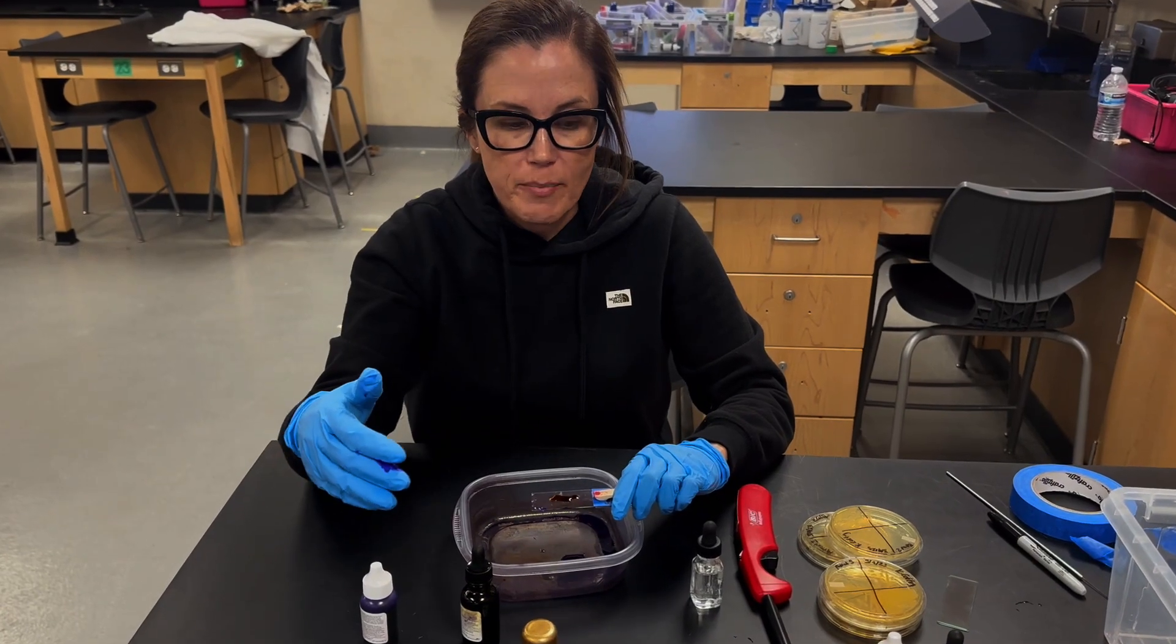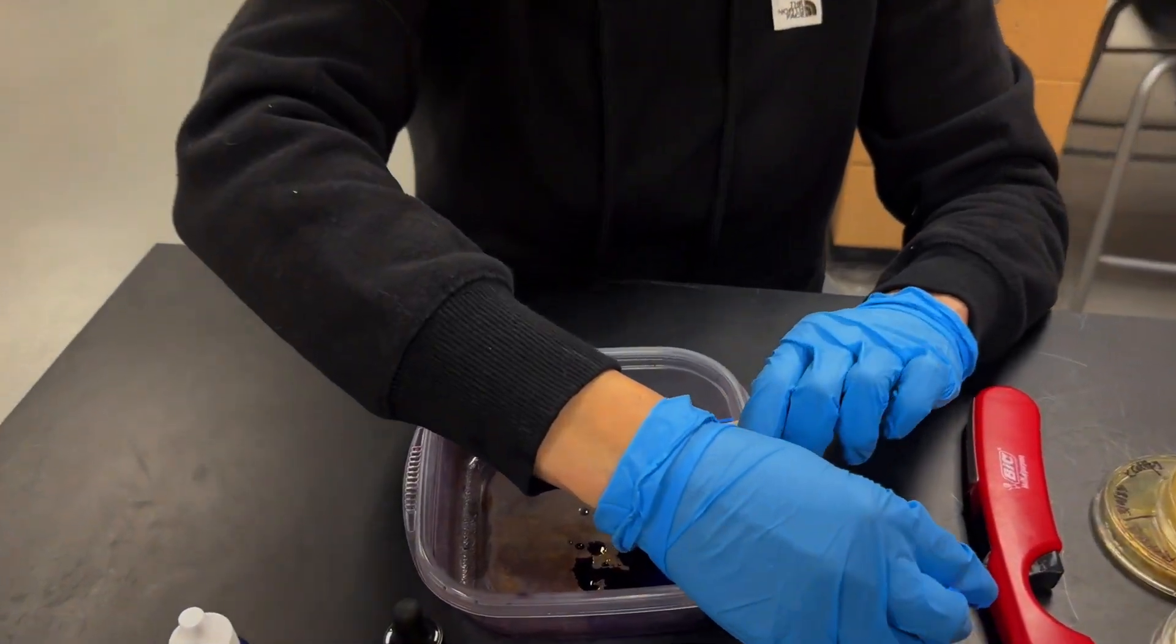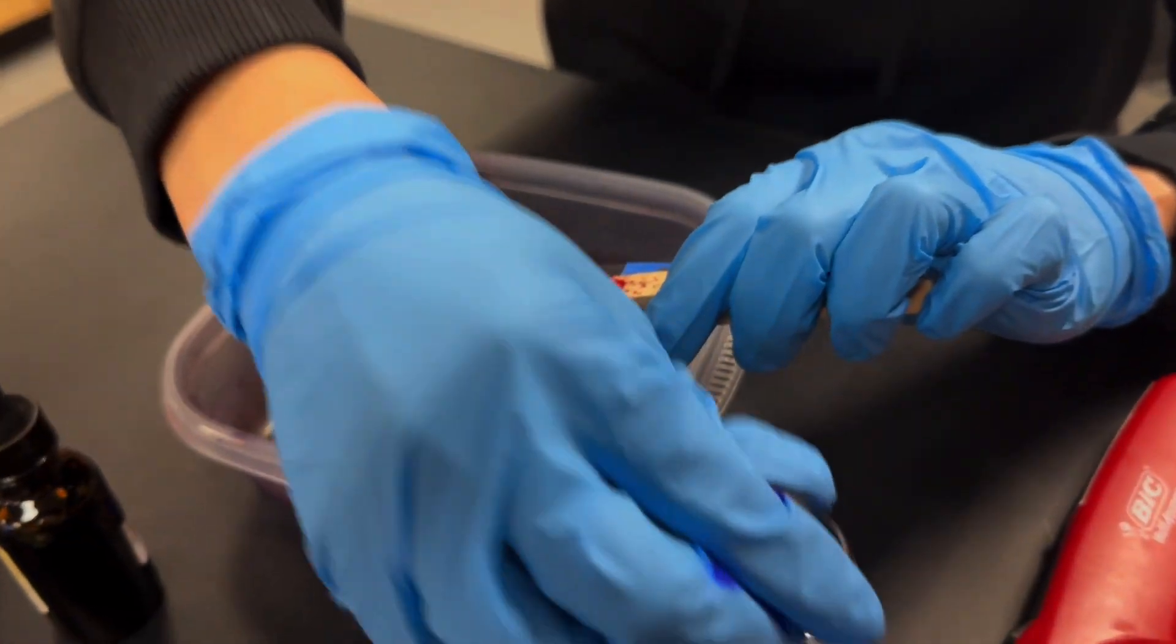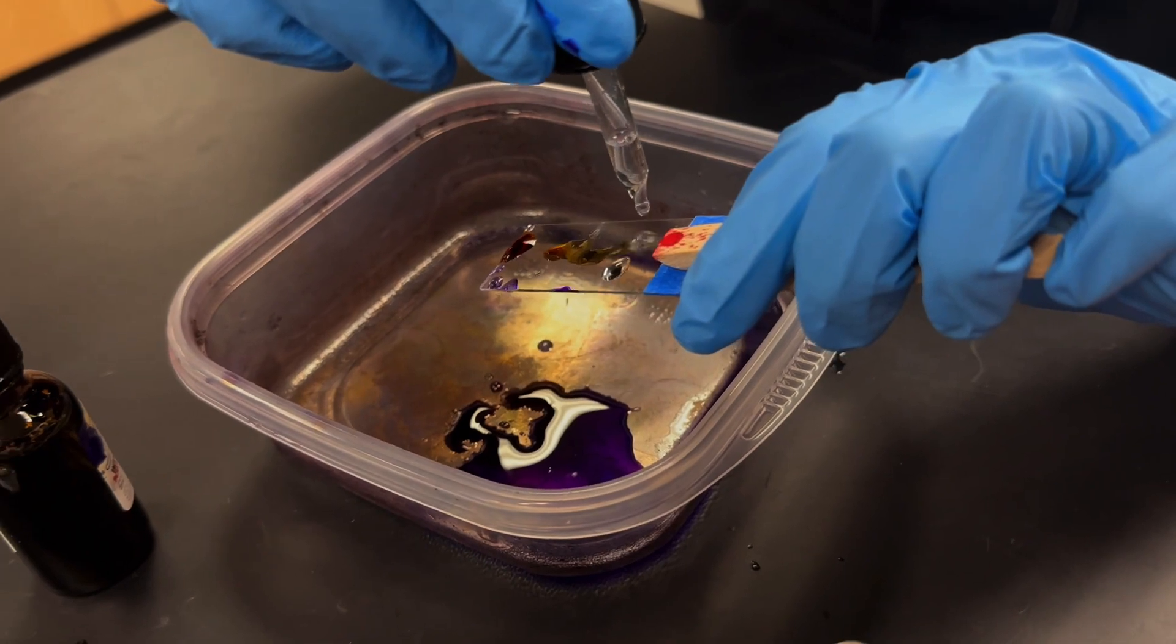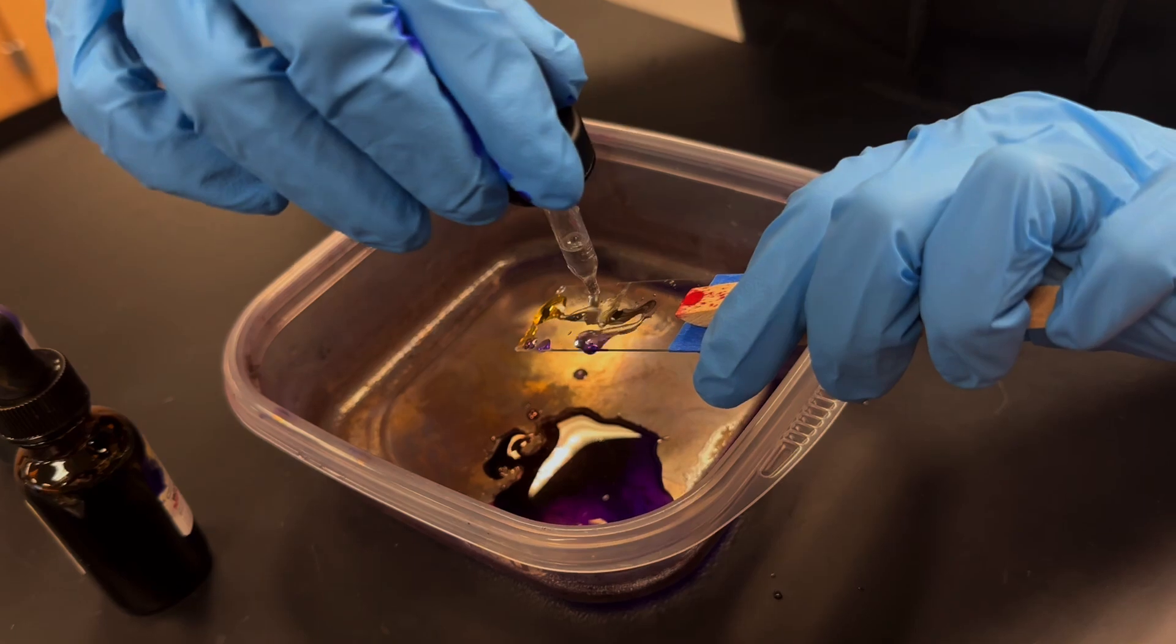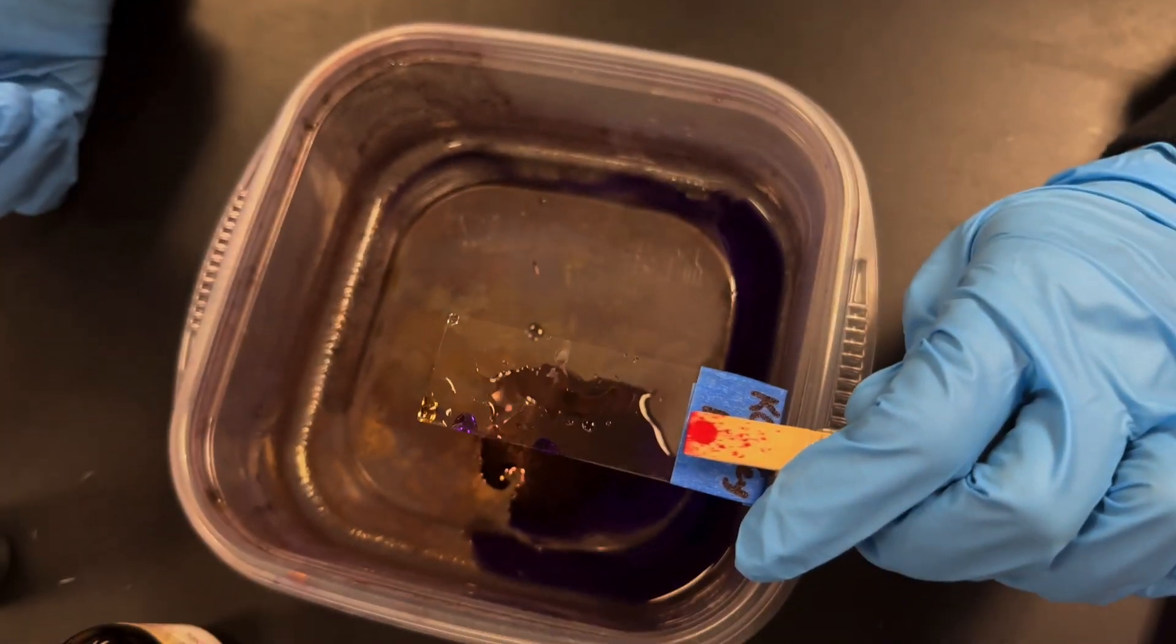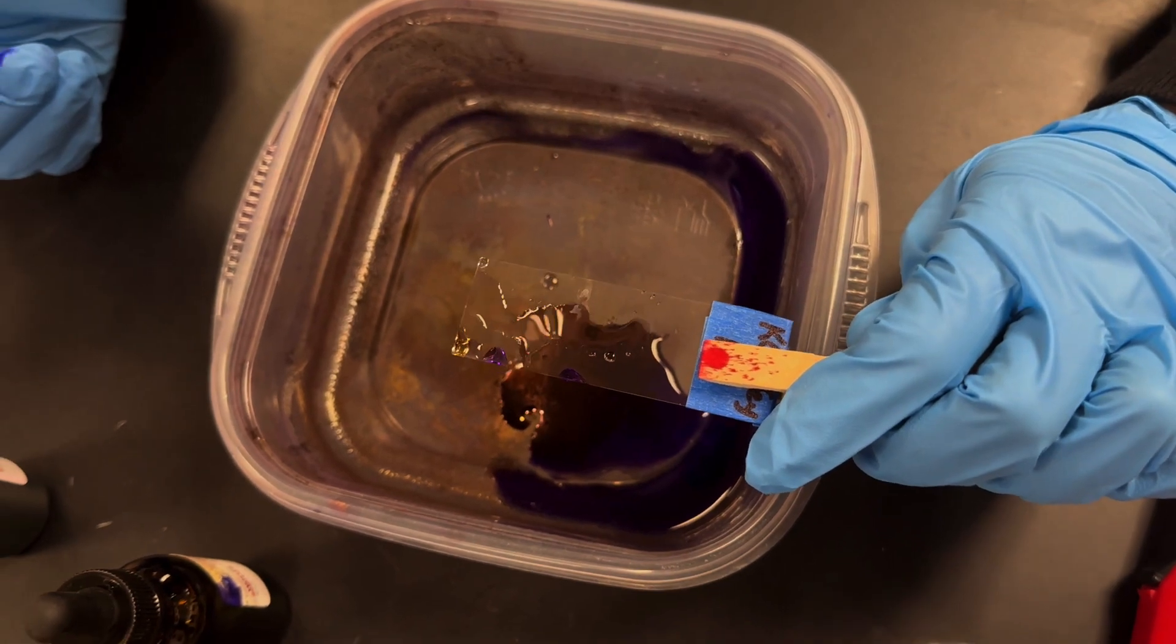Once one minute has passed, you will rinse the Gram's iodine off the same way that we did before. So hold it at an angle and then you'll just run it down until most of the color goes off of the slide. And then we're ready to move to the next step.